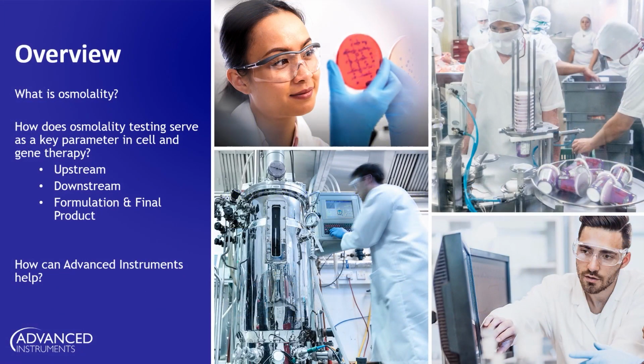On today's agenda, we'll be focusing on osmolality as a key parameter within all sections of the cell and gene therapy workflow, from upstream and downstream to then your fill, finish and final product. Included in that, I'll be taking a look into retro and lentiviruses in particular also. And then to conclude, I'll be presenting what AI can provide to you as a customer, looking to include osmolality testing into your laboratories. We'll also be putting some questions to the audience via the chat box throughout the workshop, and we would really appreciate it if we could get as much feedback as possible, as this in turn will help us help you.